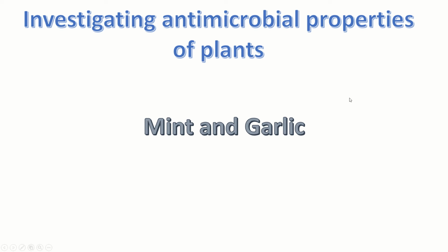Hello, so this is looking at investigating antimicrobial properties of plants. And the two plants we're going to look at are mint and garlic. So, how do we do this?